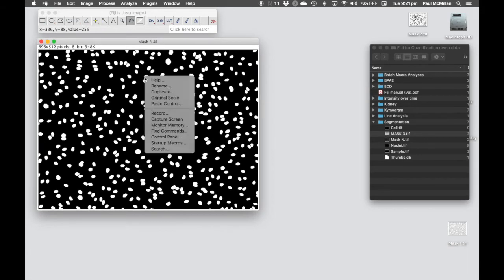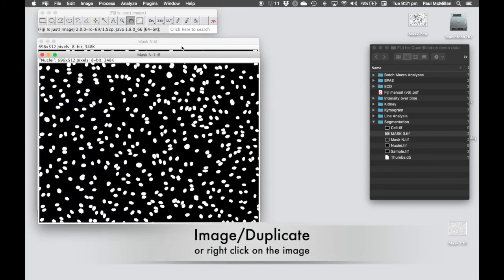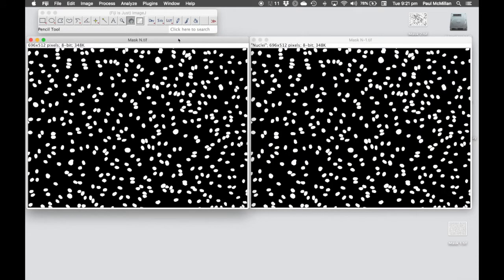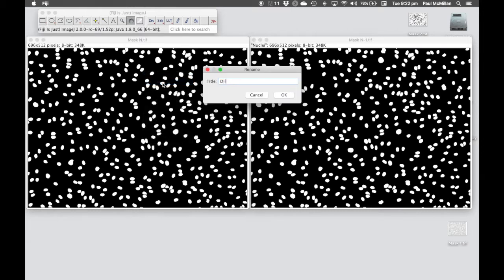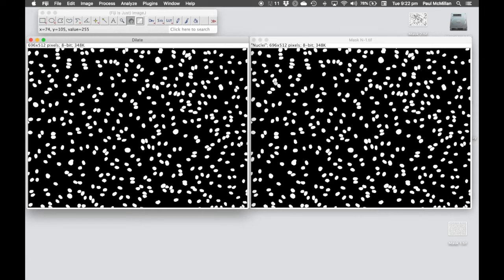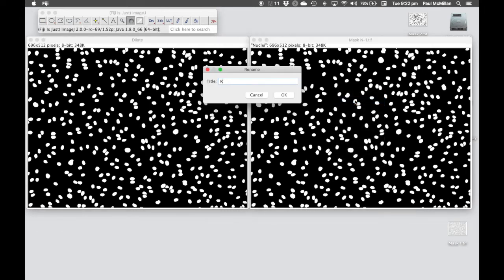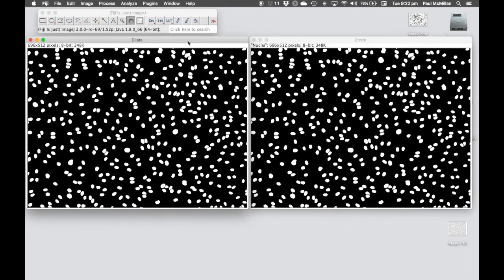So in this case, I'm going to duplicate these images again. And we're going to rename them. So let's rename one dilate. And we're going to rename the other one erode. Ooh, typo. And you'll never guess what we're going to do with these.